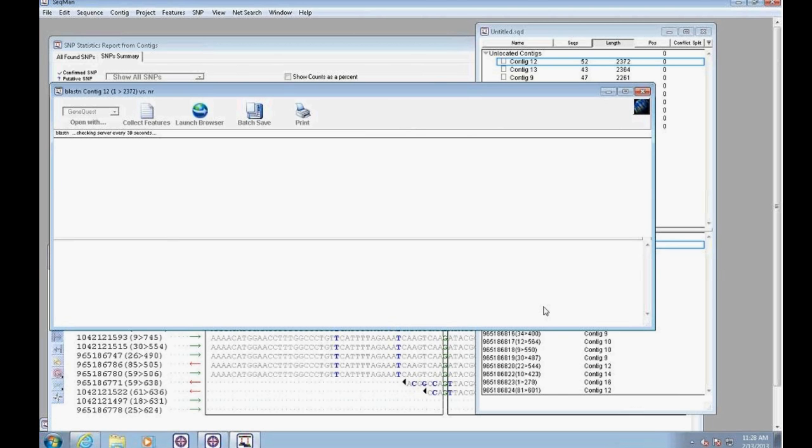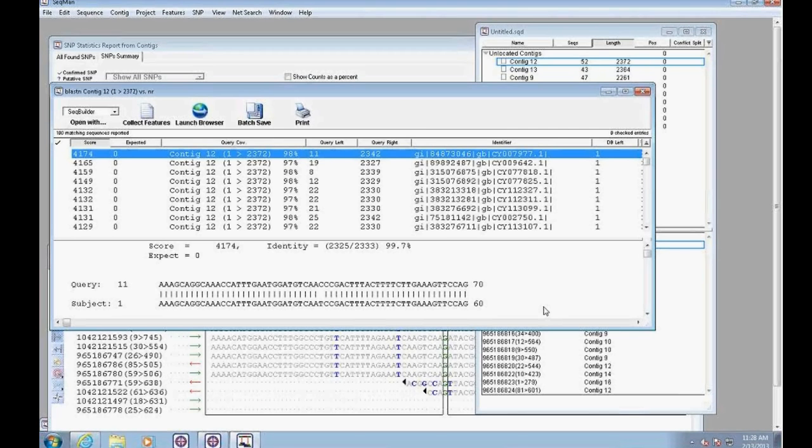While we're waiting, another question that came in, I think you may have mentioned this at the beginning, but can you just explain, is it possible to use next-gen data with SeqMan Pro? Definitely, you can perform all of your analysis of next-gen data in SeqMan Pro, as with Sanger data. So definitely that is possible. We have tools that will allow you to generate project files for next-generation sequencing assembly and alignments.